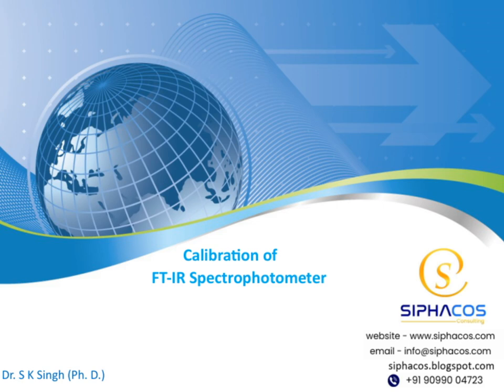I'm Dr. S.K. Singh, and I'm excited to guide you through this session. Today, we'll be focusing on the calibration of the FTIR spectrophotometer. Over the next few slides, we'll cover the key steps involved in calibration, why it's important, and how to ensure accurate measurements. Let's get started and explore this essential aspect of spectrophotometry together.